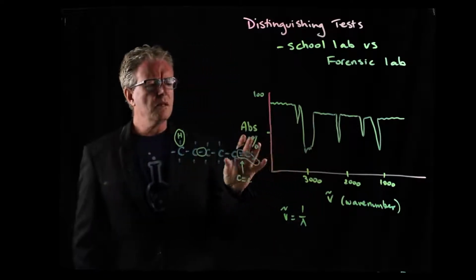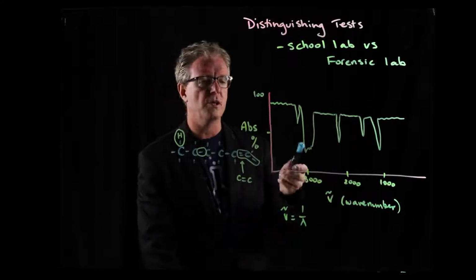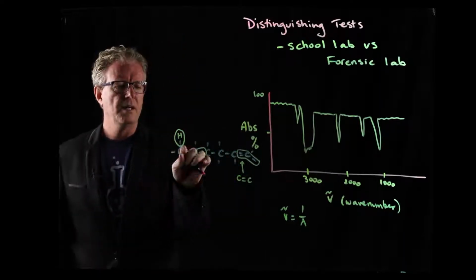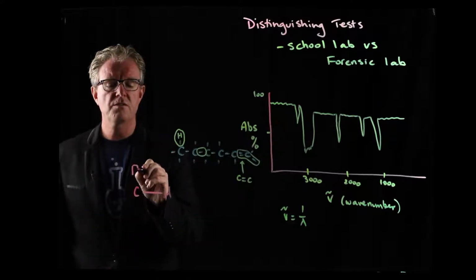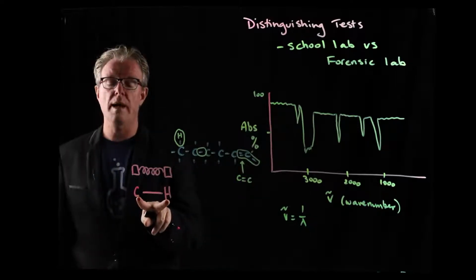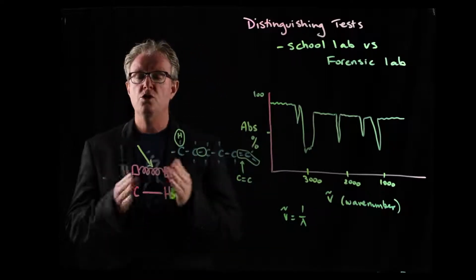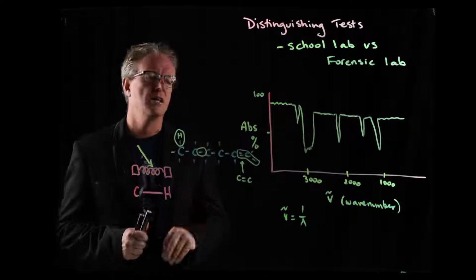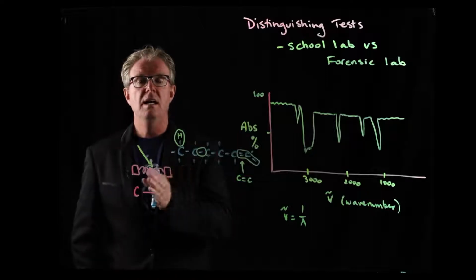So the different bonds will absorb energies at different places, and when they do absorb it, they have what's called a stretch, okay? If we think of it like this, if we have the carbon and the hydrogen bond, I'm exaggerating here, like a spring connected between the two, and those boxes represent the two atoms, when energy comes along, that energy can cause that spring to change in length, to vibrate. So as it absorbs the energy, it vibrates backwards and forwards and has a stretch. There are other different bond associations as well. The stretching is just one of them.